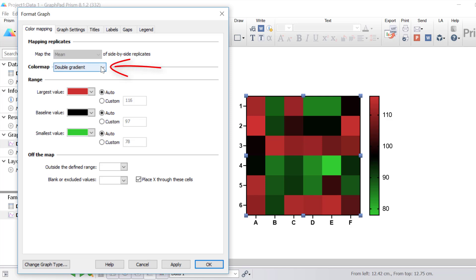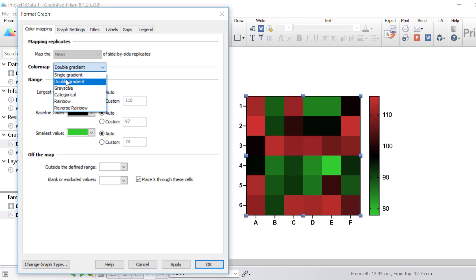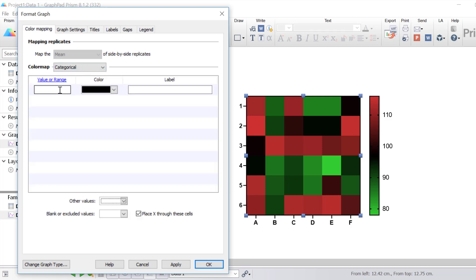The colour map dropdown is where you can change the colour style of the heatmap. There are six choices. Single gradient is similar to double gradient but with only a single colour. Double gradient lets you choose the baseline value and two extreme colours. Grayscale represents the smallest and largest values as either black or white. For categorical, you can enter a value or range of values and select what colour you want it to show as — note that ranges must not overlap, so instead of 1 to 2 and 2 to 3, you would use 1 to 1.99 and 2 to 2.99.